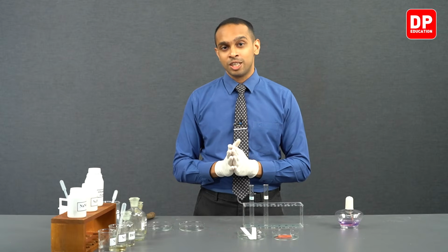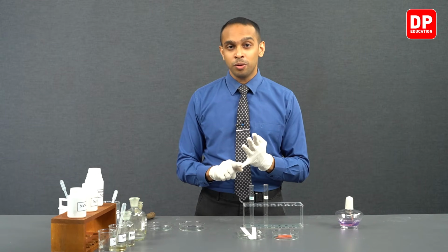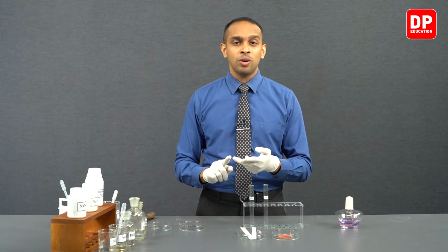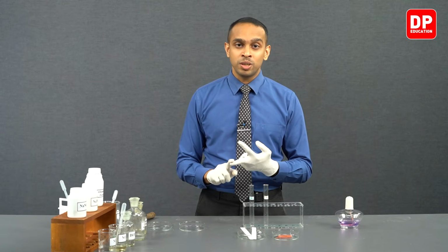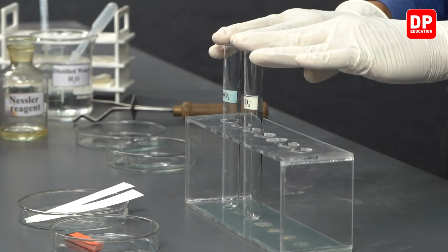So in this experiment we are going to be using aluminium powder, or pieces of aluminium can be used for this experiment. Zinc powder can be used, or there's another alloy referred to as Devarda's alloy, which can be used for this experiment. Out of these three options, we have aluminium powder here, and we are going to conduct this experiment with aluminium powder. First, we are going to take these two test tubes that are labeled nitrite ion solution and nitrate ion solution.